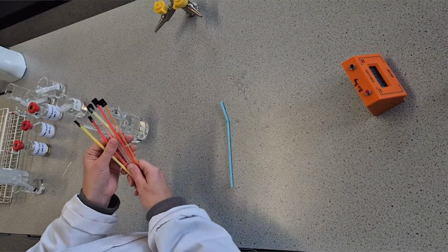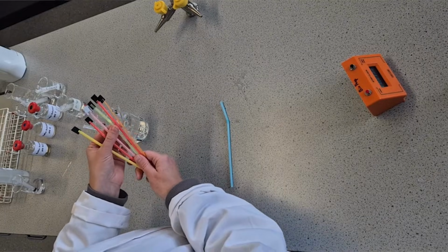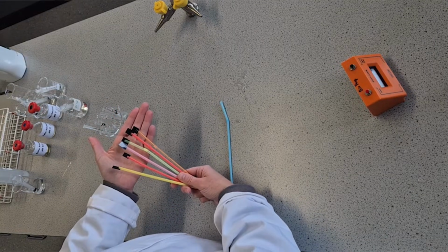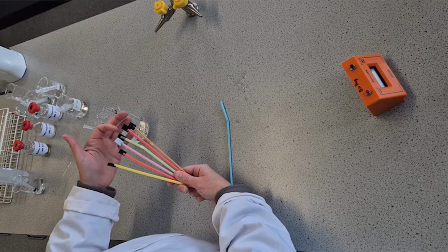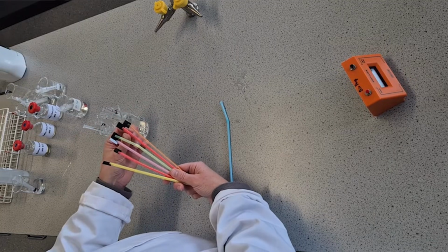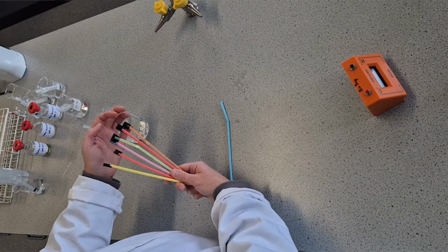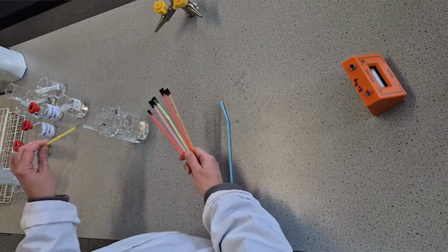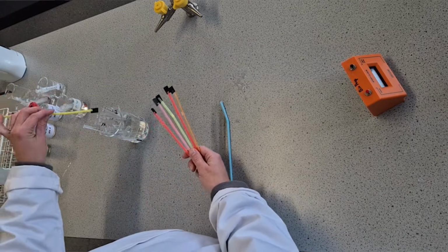Now this one in particular, they could also comment when it comes to their write-up. We can see that these pieces of film are not exactly the same size. So that means our substrate volume and the concentration should be the same, but the volume of the substrate is different. The larger pieces of film will take longer to turn colorless than a smaller piece. And actually this, I might find that some of them fall off. So we'll see how it goes.